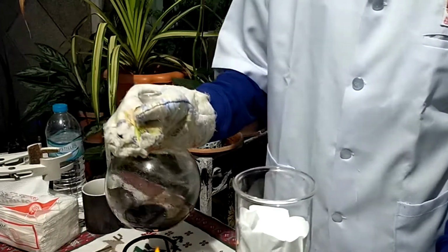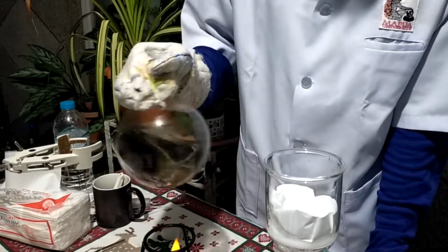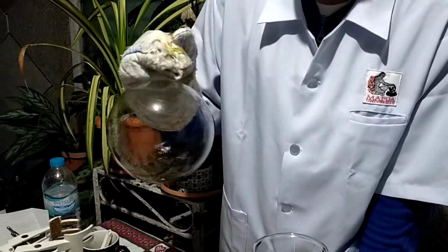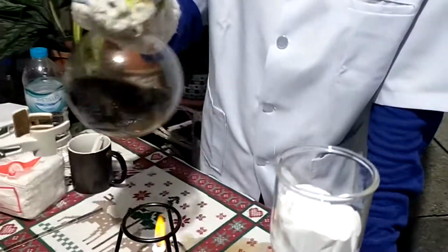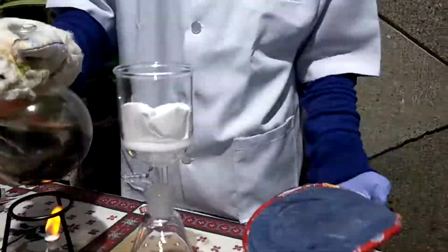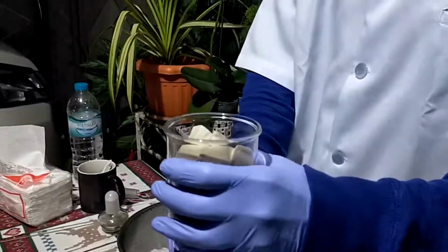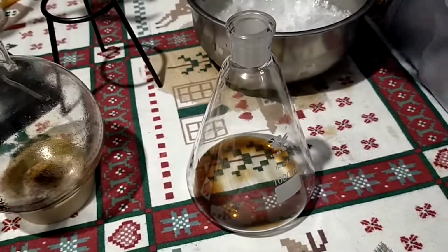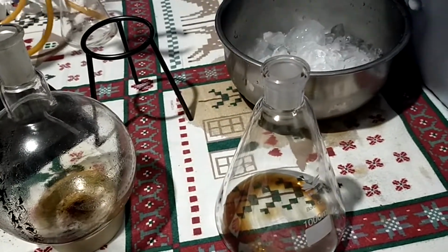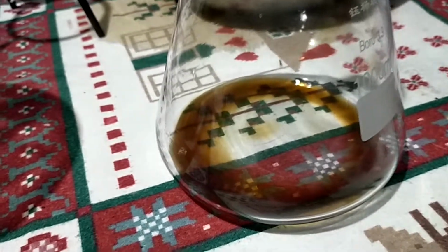I added 5 more milliliters of ethanol in this flask because there is still some caffeine sticking in the bottom, and I do believe that this caffeine will not leave the bottom of the flask anytime soon. So I will now proceed to filtration. Okay, so this is the only amount of solution that we were able to obtain. Now we're going to subject it into an ice bath in hopes of crystallizing the caffeine.